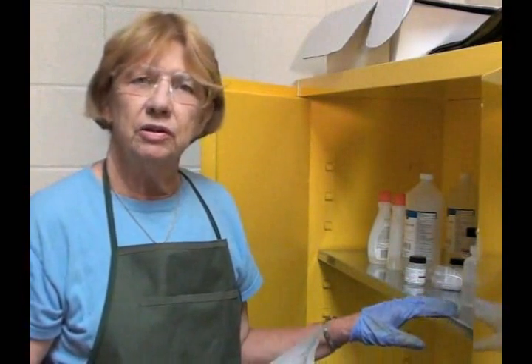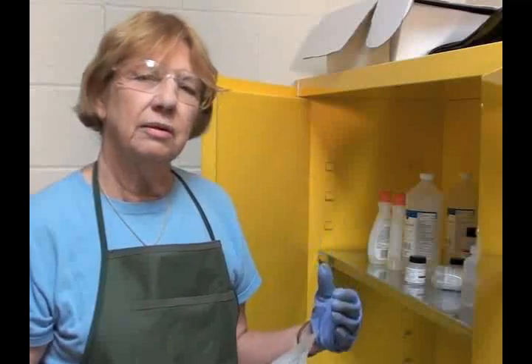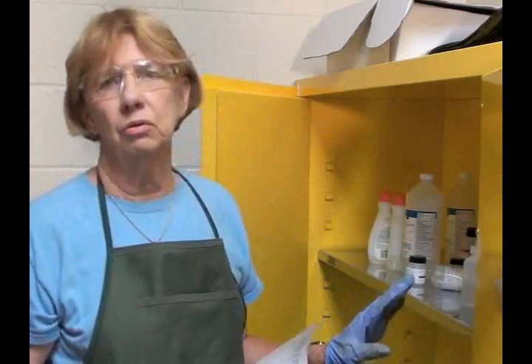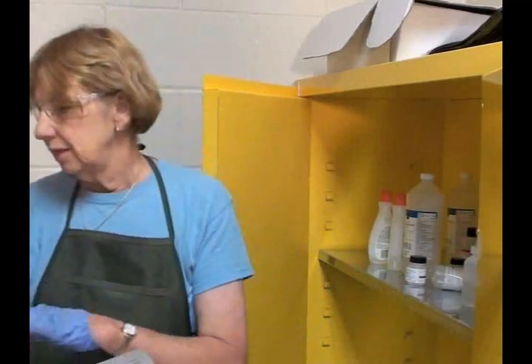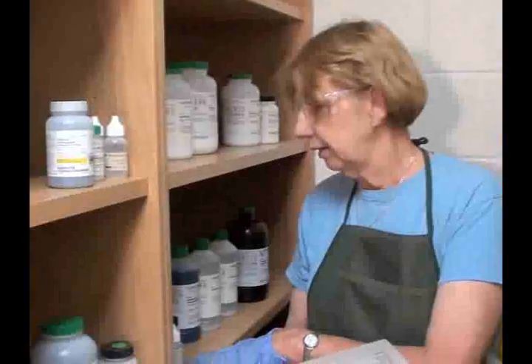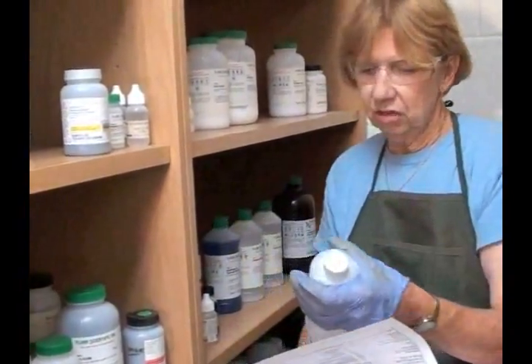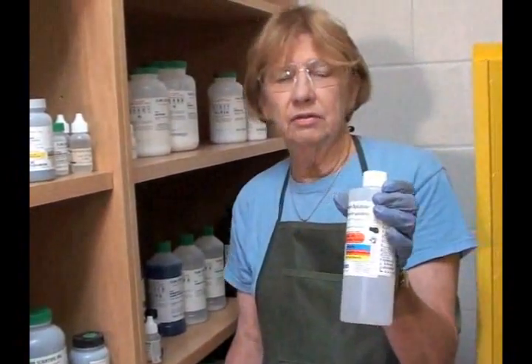Commonly, we will find oxidizers stored in the flammable cabinet, which is the worst possible place for them. Because even though under the DOT regulations, flammable materials and oxidizers are considered the same class, they are incompatible. So an oxidizer should never be stored with flammables. And I see here, just on the other side of the flammable cabinet, that there are some indicator solutions that are dissolved in alcohol, so they are flammable. These materials need to be kept in the flammable cabinet.